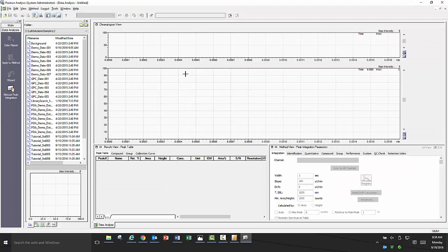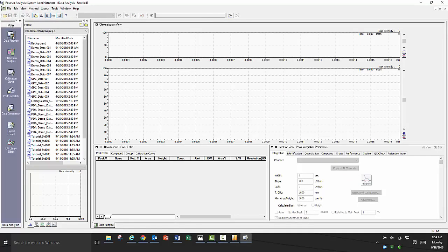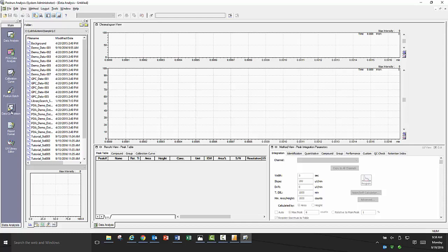Once post run is opened, you will see the assistant bar on the left. If you click on the main tile you will see all the options you have accessible in the post run software including data analysis, PDA data analysis, calibration curve, post run batch, data comparison, report format, and UV library editor.